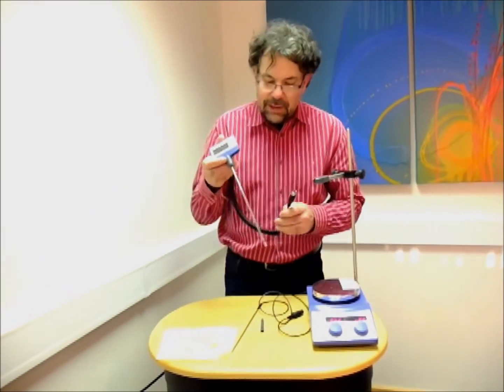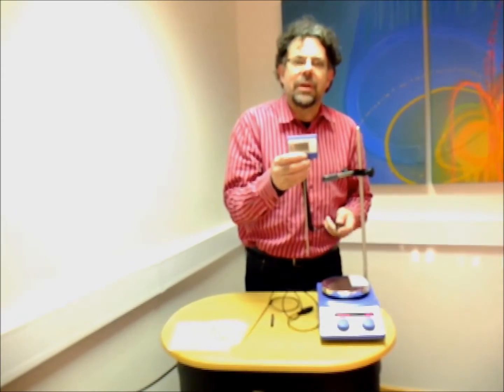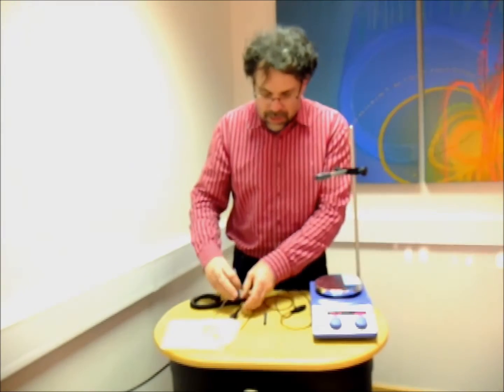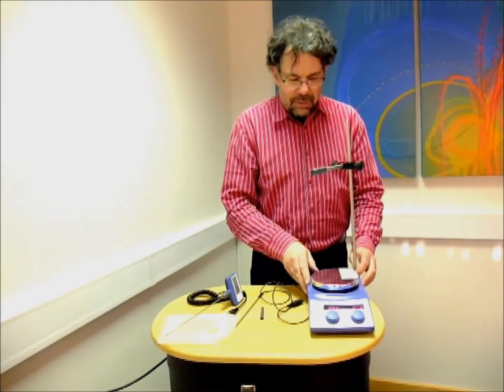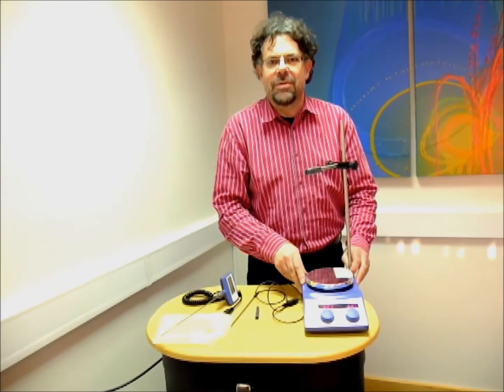It also ensures that if there was a catastrophic failure of the temperature circuit, this totally independent circuit will limit that maximum temperature. Using all three together makes it a very safe hot plate to use overnight. These hot plate stirrer packages are manufactured in Germany to the highest standards and have a two-year warranty. Hopefully that's been very useful to you if you're considering one of our packages. Thank you.